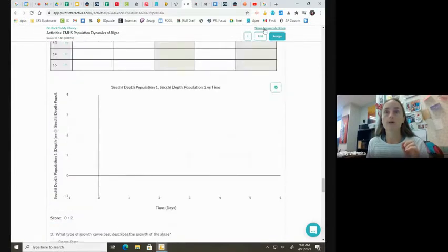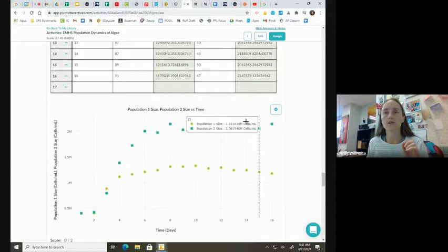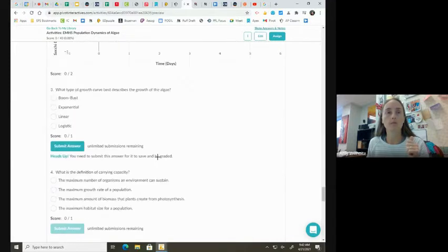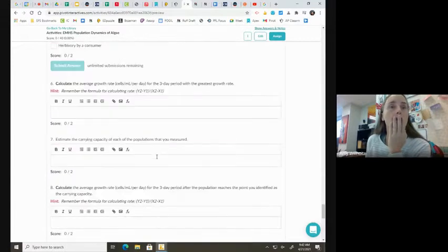I'm going to pop this back on again. So our highest growth is right in this area, wherever you're seeing this big slope right here. That's the highest growth. This is like no growth. This is like just chilling. It's your highest population, but it's not the highest growth. Are we good with that concept? Anybody have questions about that? Because that was something that confused quite a few people on one of our other tests. I don't remember which one it was. Okay. So we got that done.